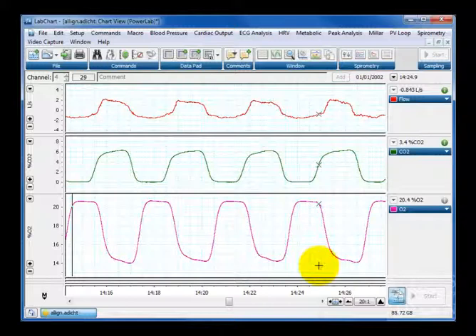Obviously we often record complex data from many different bits of equipment and many different applications, and quite often you'll find that you get a lag between various measurements simply because some of the systems take longer to do their measurements than others.